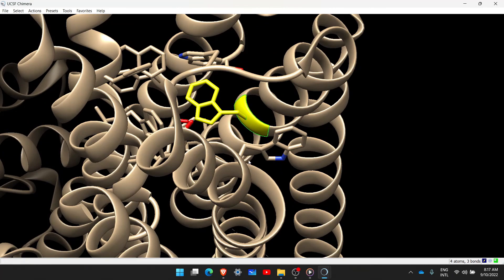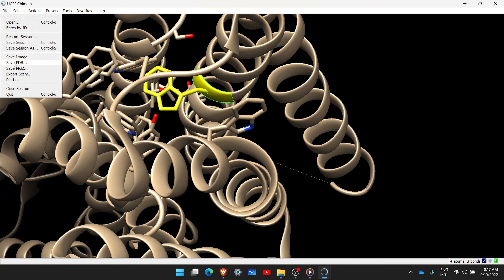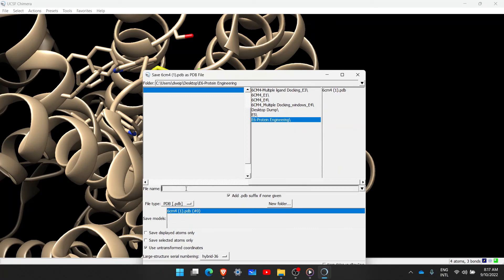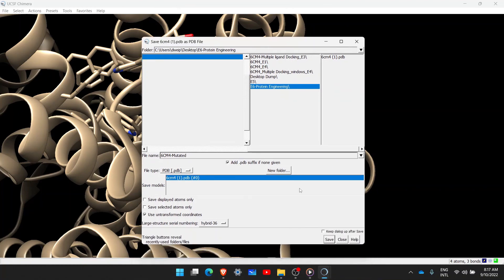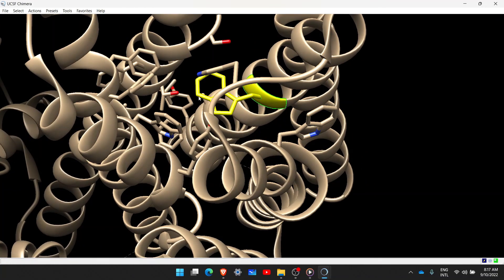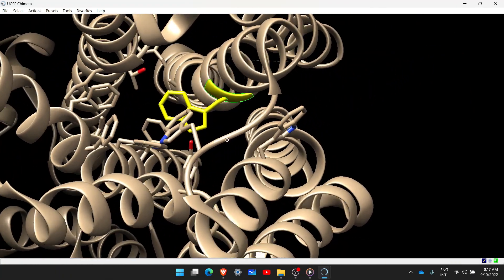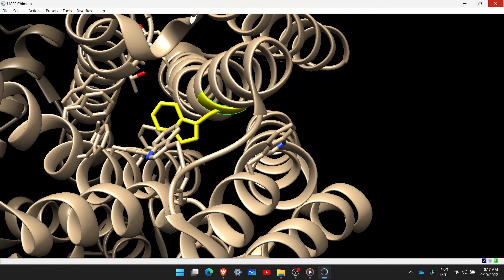Now we have manually mutated the protein. After the mutation, go to File and save this PDB into the same folder — name it '6CM4_mutated'. You can then take this mutated protein and perform docking as I explained in Episode 1 and Episode 2. If you are not familiar with docking, go back to my previous playlist and check Episodes 1, 2, and 3 where I have strictly covered docking. This is how you can perform manual mutations in the active site of a protein. Thank you.